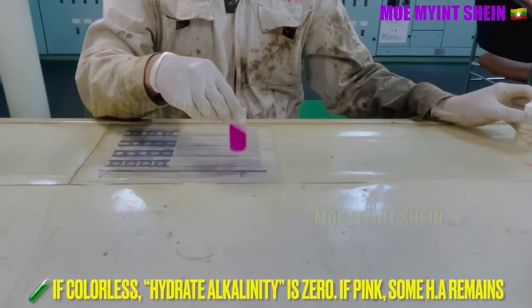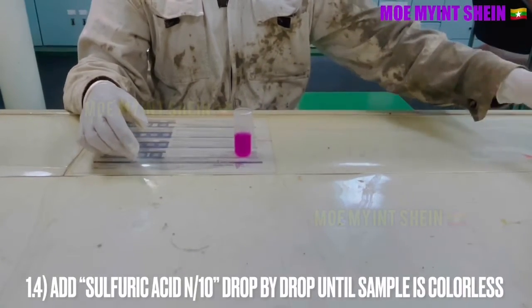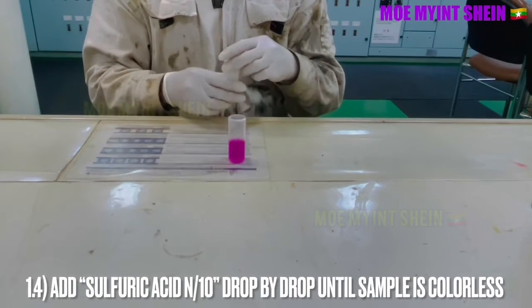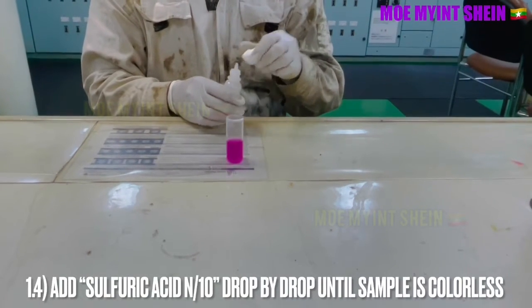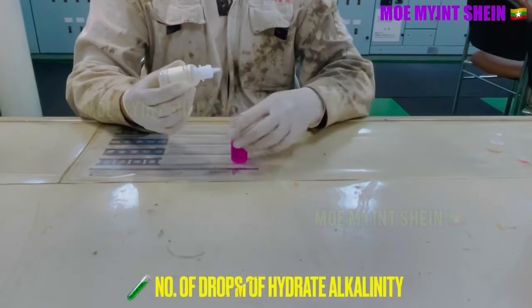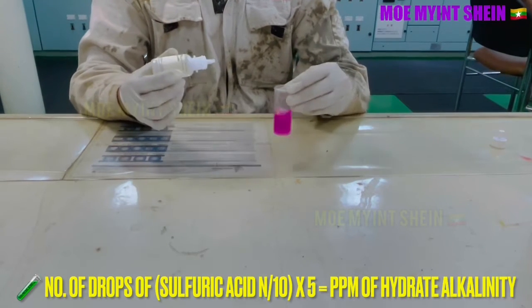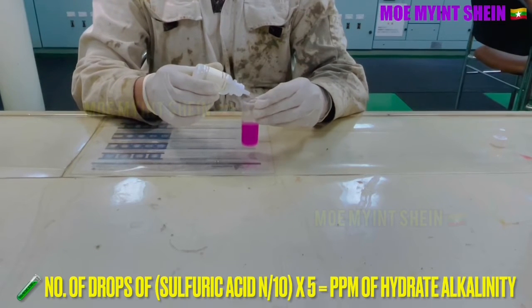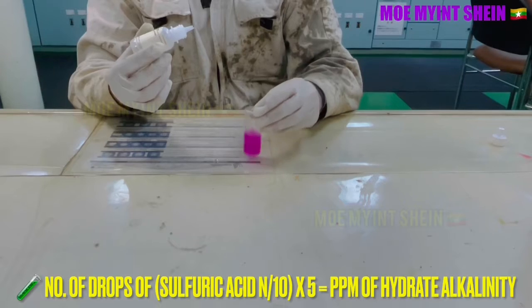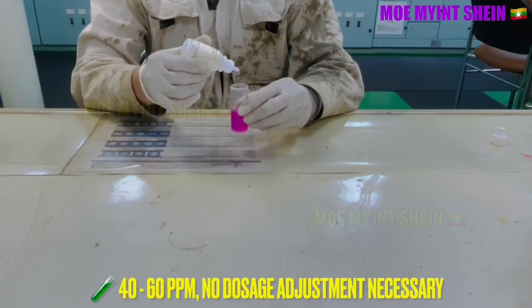If the sample water in the vial is colorless, hydrate alkalinity is zero. If the sample water turns pink, some hydrate alkalinity remains in the water. Add sulfuric acid N/10 drop by drop until the sample is colorless. PPM of hydrate alkalinity is obtained by multiplying the number of drops of sulfuric acid by 5.